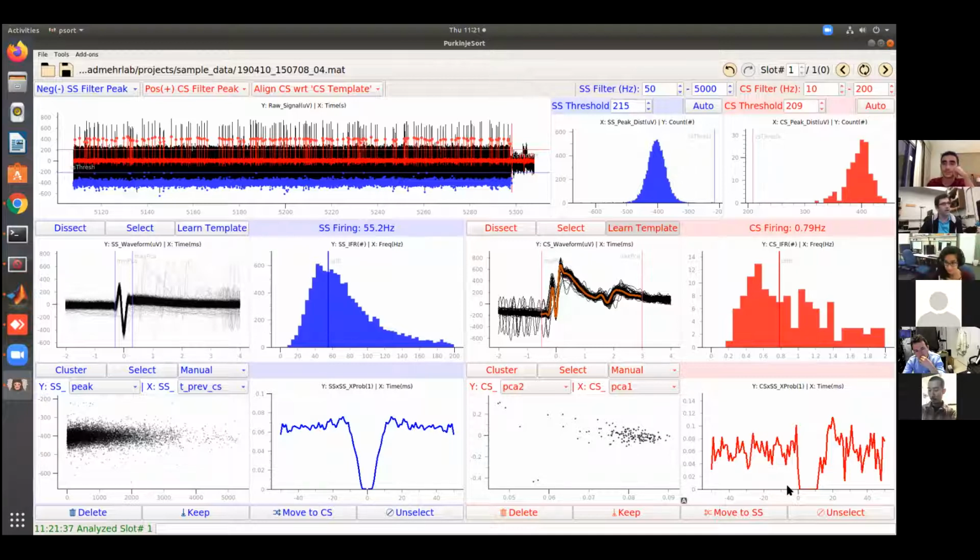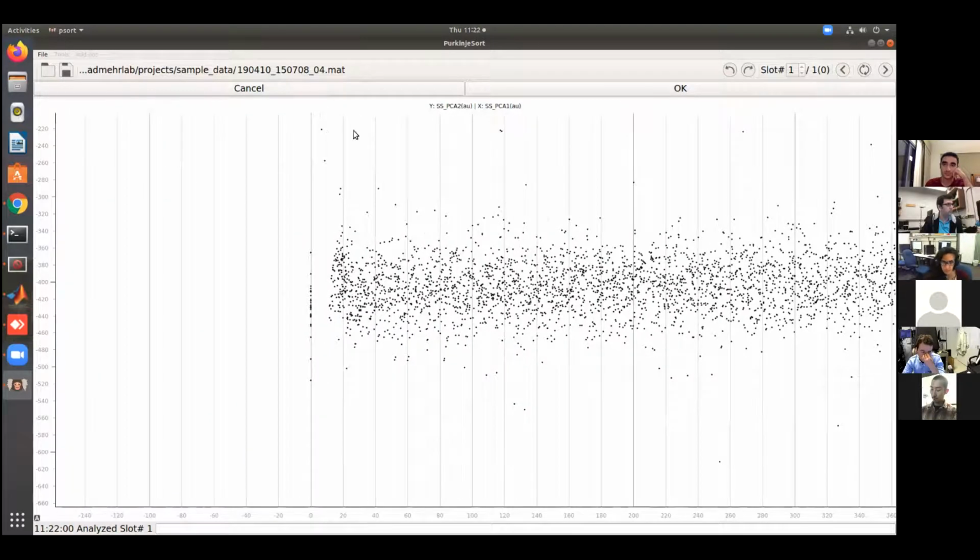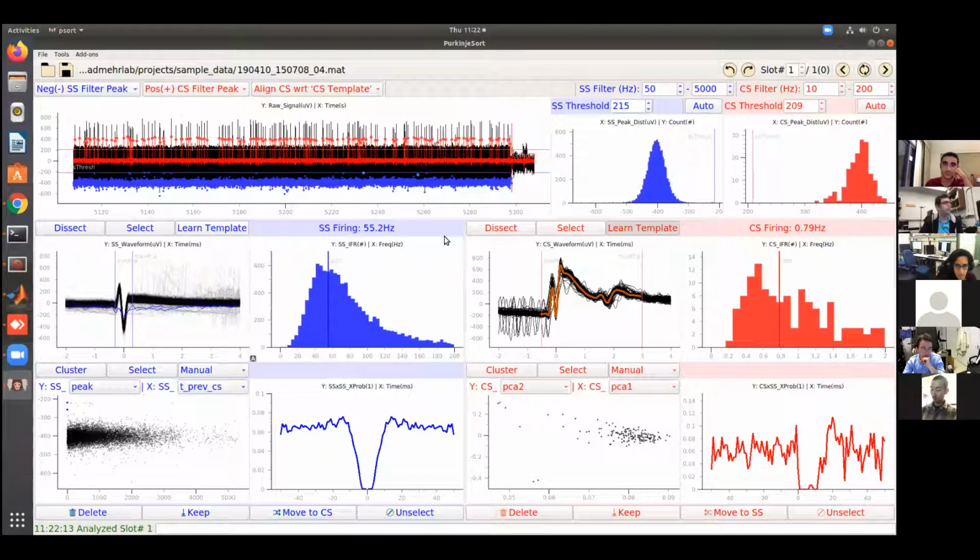And just for the sake of time, if you want to go ahead and directly make sure that those 2 are in fact spikelets of a complex spike, let me just undo what I did. So you can hit undo here. Now they're back in business. And let me select them again. And so these 2 have been selected.